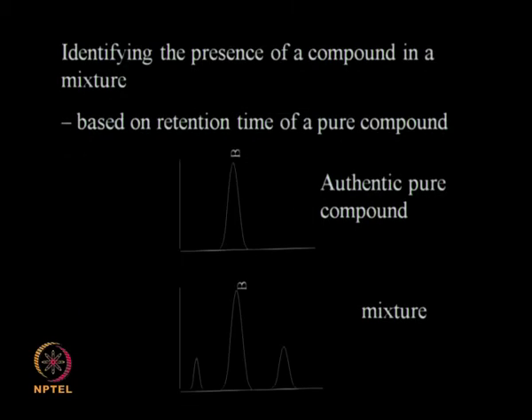Now, how can you use HPLC for detecting a compound in a mixture?